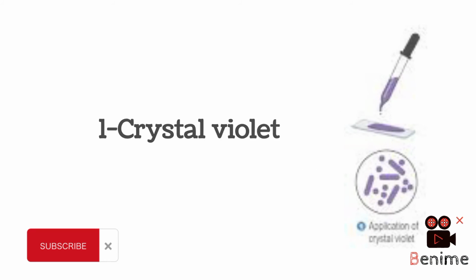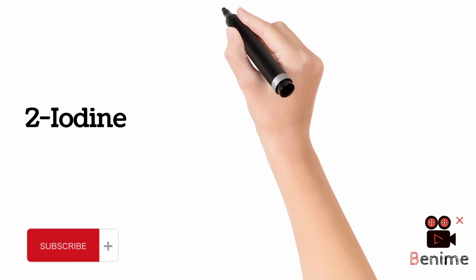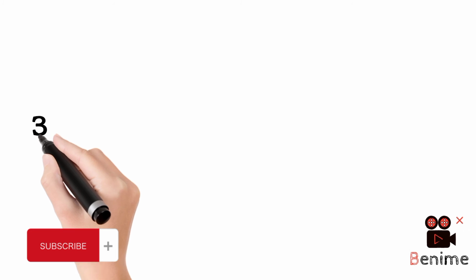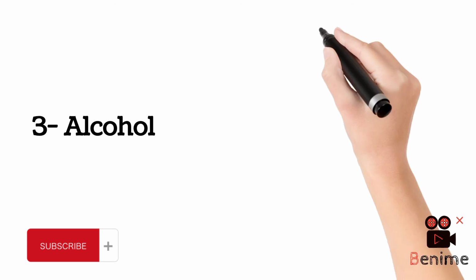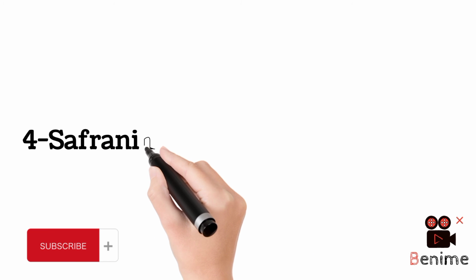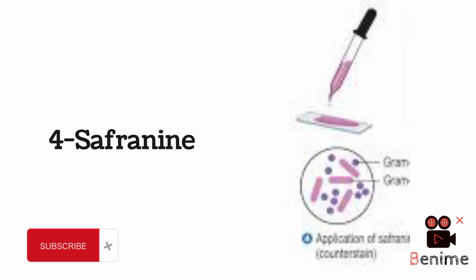Second, apply iodine, which forms a CVI complex, and then wash with tap water after 2 minutes. Third, apply alcohol and wait for 30 seconds. After applying alcohol, the gram-positive bacteria retain the CVI complex, and the gram-negative bacteria lose it and again become colorless. Then, lastly, we apply a counterstain of safranin, and the gram-negative bacteria retain it and become pinkish in color.